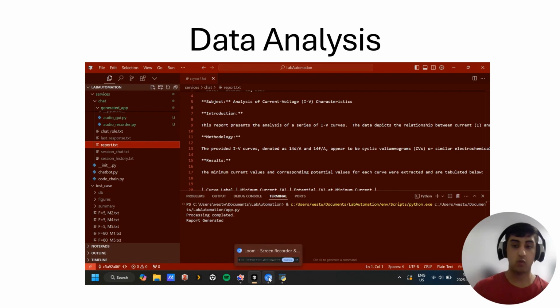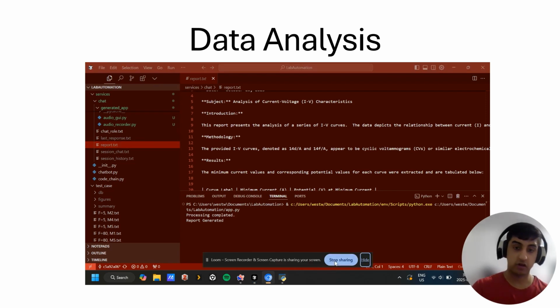So this is what the product is. It not just analyzes the data, but it also automates the data collection. Overall, this can lead to increased productivity as a researcher. In my research, I went from doing just 3 to 5 experiments a day to doing over 240. And another researcher that used this tool, she was able to increase her research productivity by 25%.